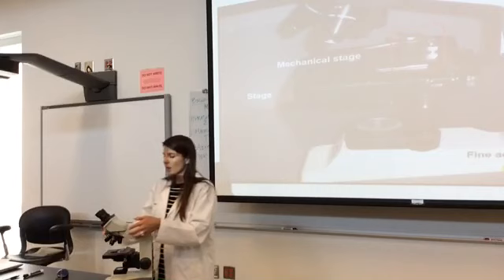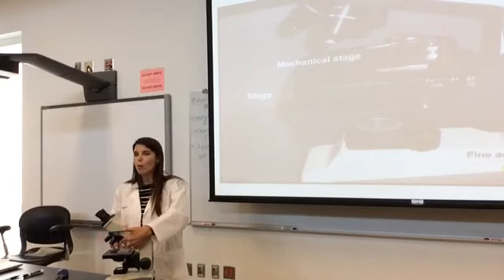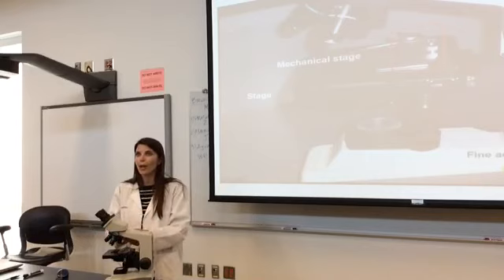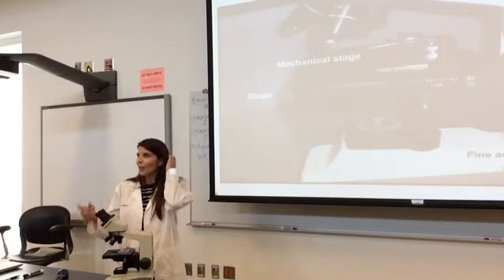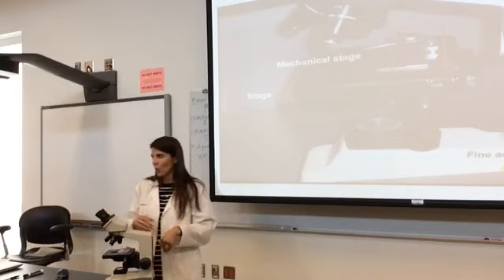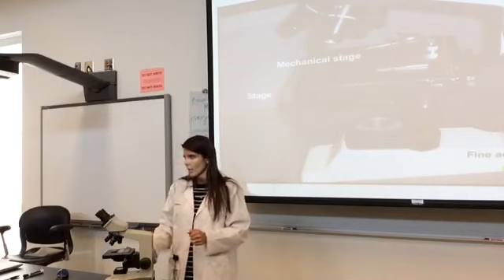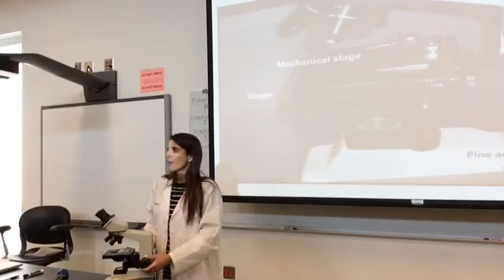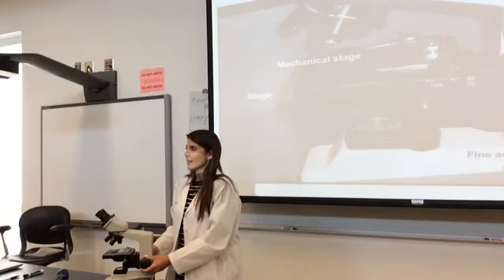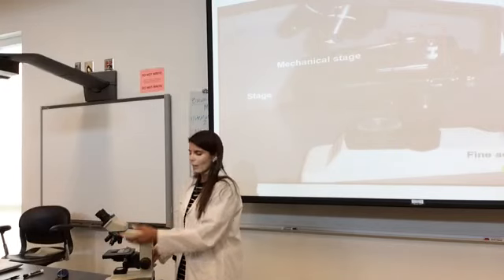Before you start playing with it, will you please take your nose piece and put it on the smallest objective, so engage the red one. That way, while you're playing with it, you don't break anything. Okay? So we'll get to where we change them, but right now, if you'll just put your smallest objective, the red one. Yes, thank you. So the red one should be the one that's engaged.